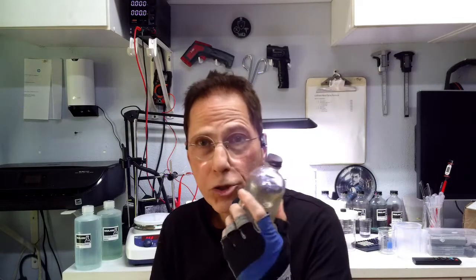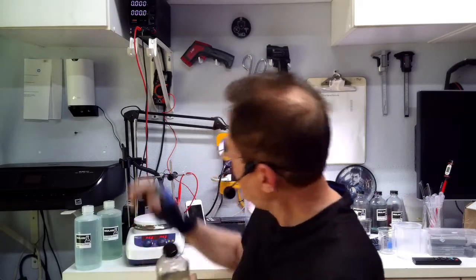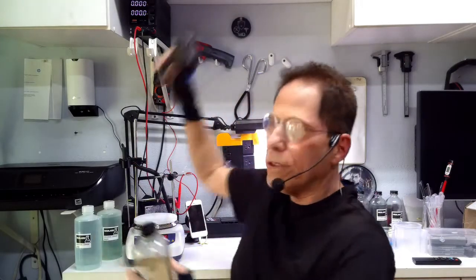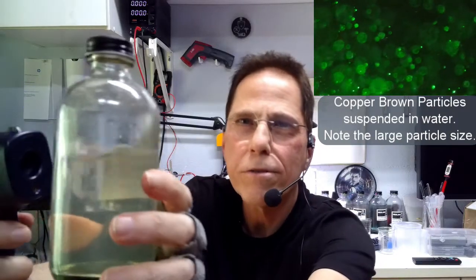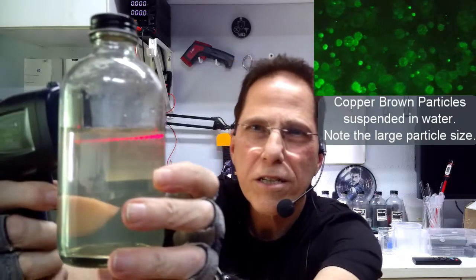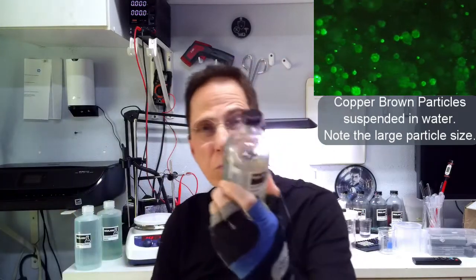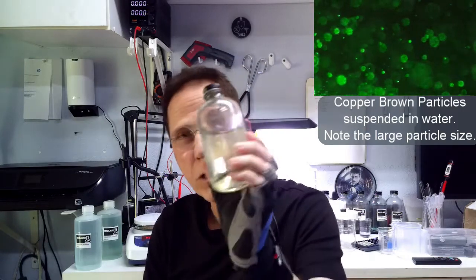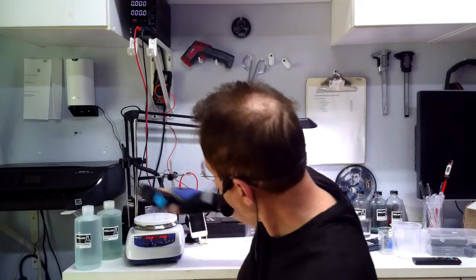Now, this had no oxidation at all when I was cooking it, and consequently has no taste whatsoever. You can't taste the copper in here. But, laser-wise, let's see, laser-wise. All right, there we go. Laser-wise, as you can see, this sucker has got stuff in it. Lots of stuff. This is probably about a 30 parts per million copper solution here.